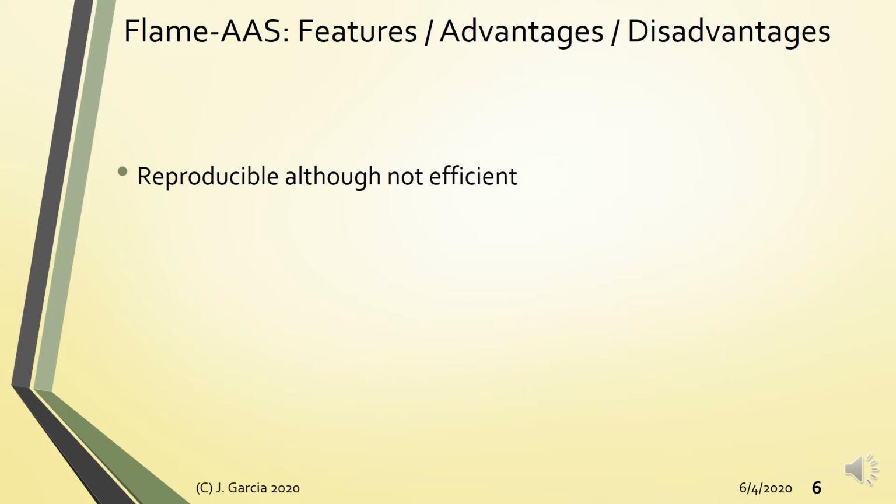Why not efficient? If you've done AAS in the laboratory, you would notice that for Flame AAS, you're aspirating your sample solution into the nebulizer and into the flame.